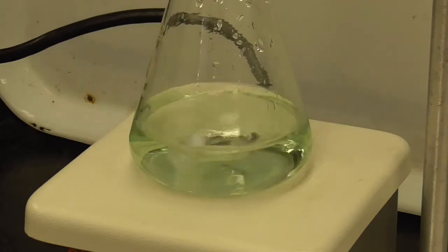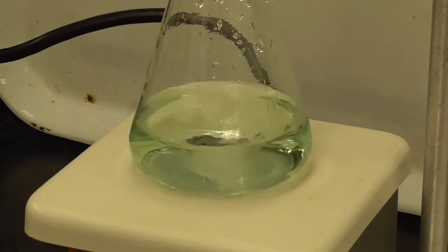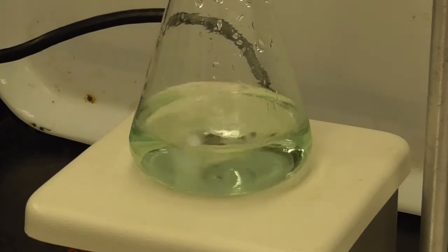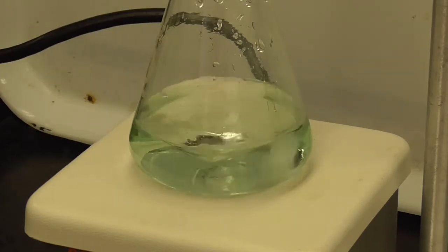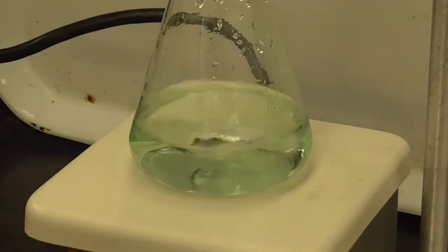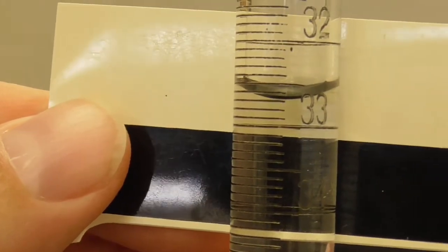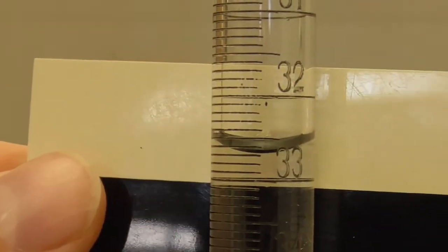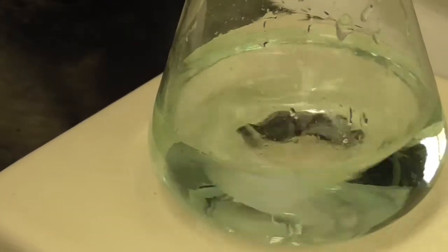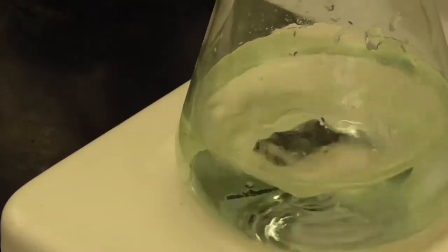Question, will it stay that color? One way that you can determine if that's the color that you like is to read the volume at this point and then add another drop and see if you like that color any better. So there's the endpoint right now, and we're going to add another drop to see if we like the color any better. Yeah, that to me is more yellow than it was.